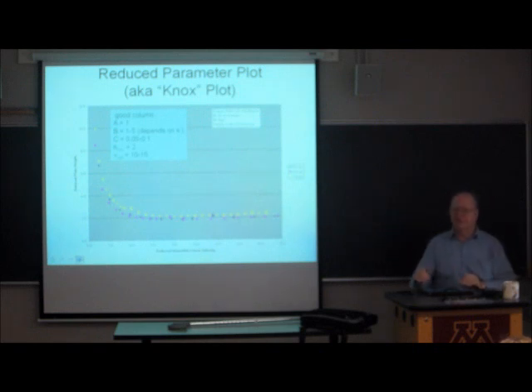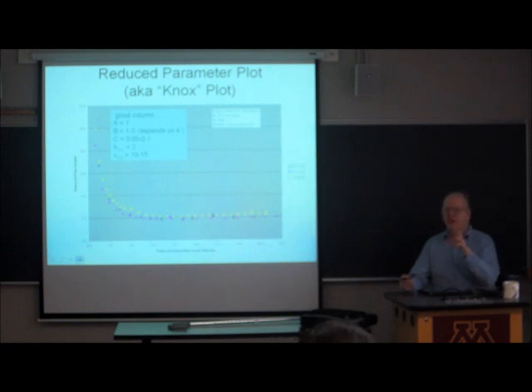So if I were to fit the three curves individually to the Van Deemter equation, what I'd find is that the A would equal the A would equal the A, the B would equal the B would equal the B, and the C would equal the C would equal the C in the dimensionless coordinate system. So there's less to remember.